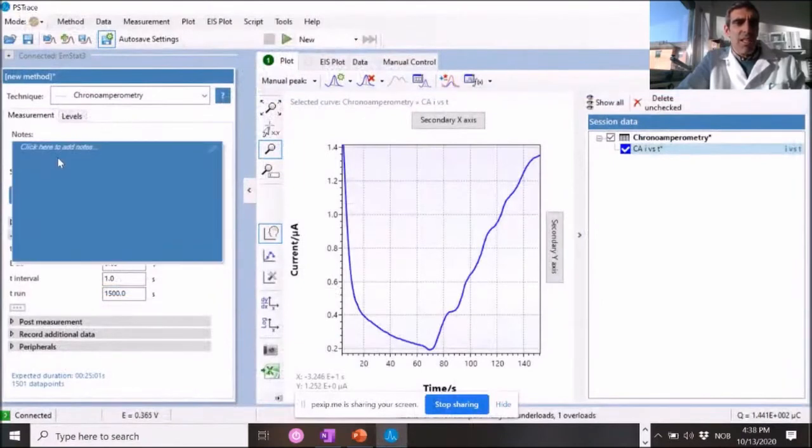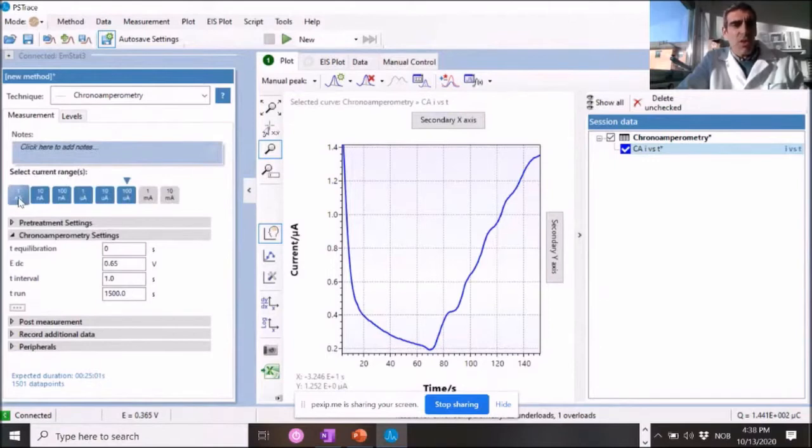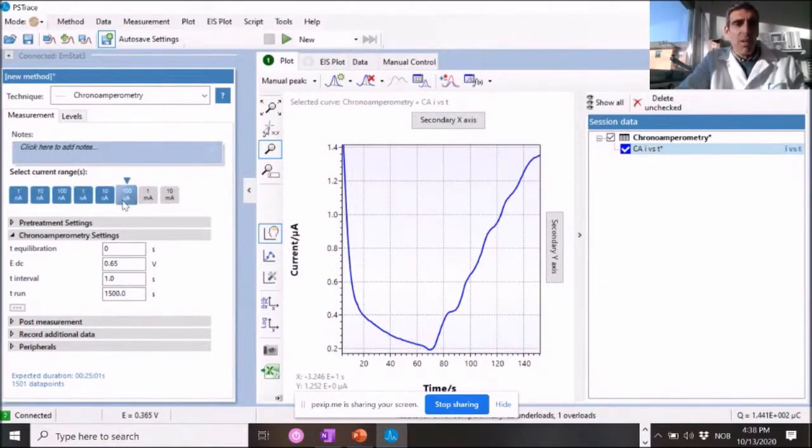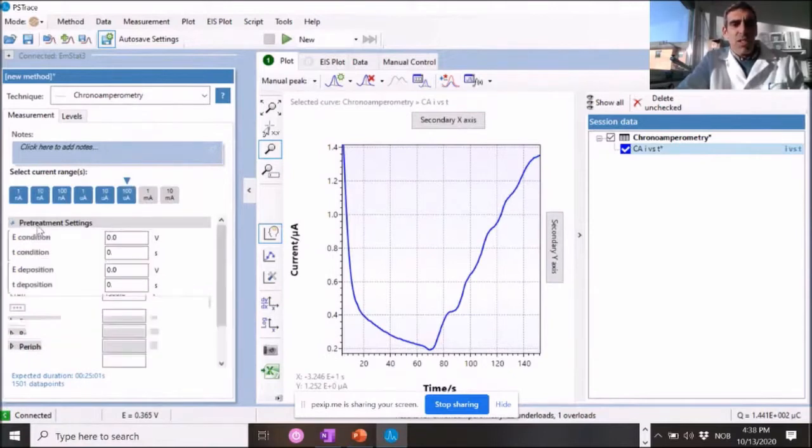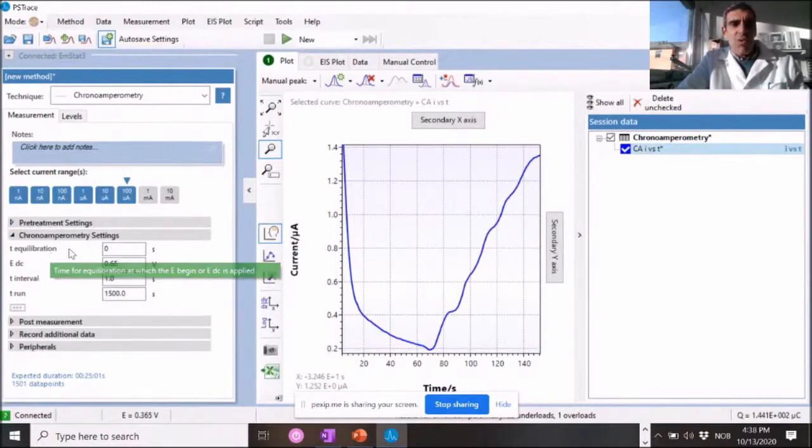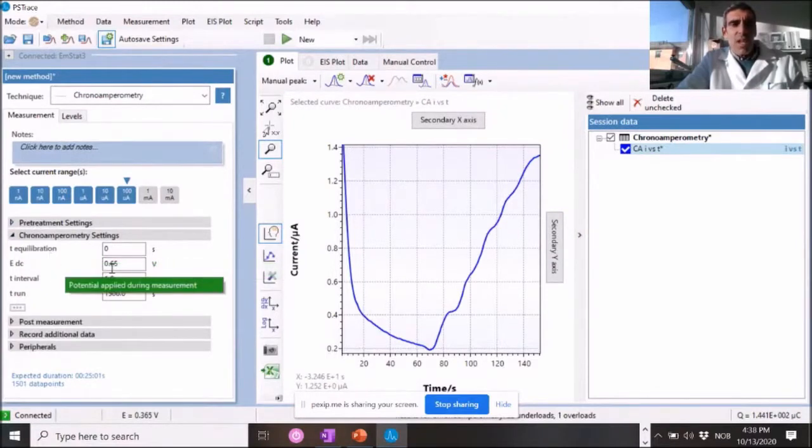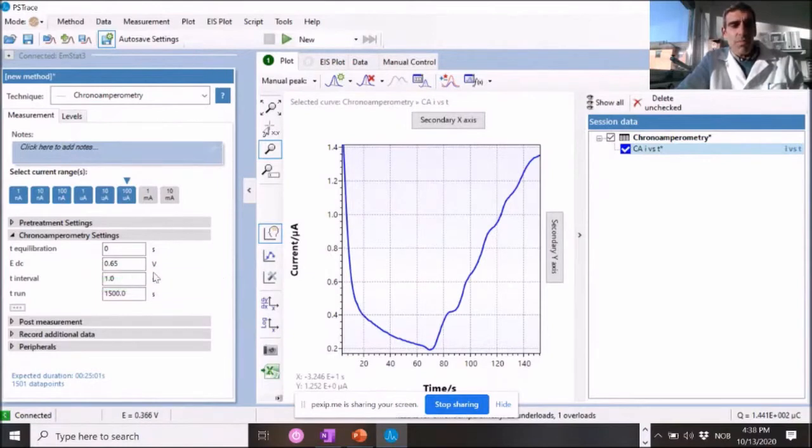And then I select the current range. I normally select for the ZP glucose sensors. I normally select between one nanoamp and 100 microamps. And I leave the pre-treatment settings at zero. I don't want that.